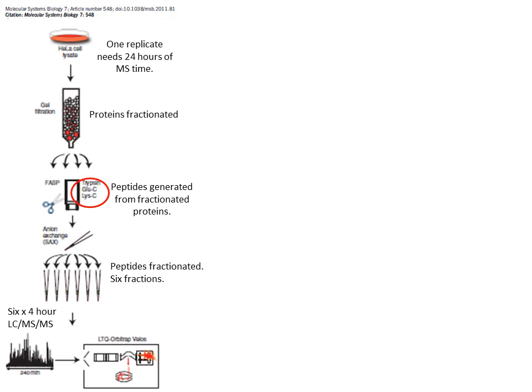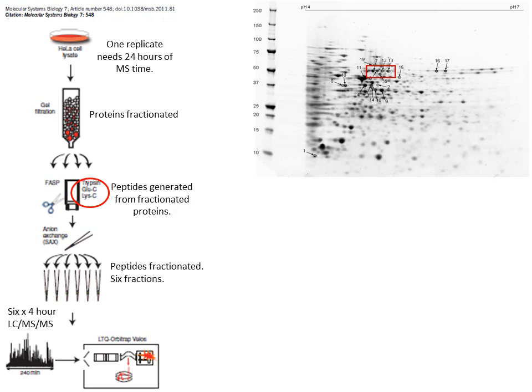This method of proteome fractionation, known as 2D PAGE or simply 2D gels, has many advantages compared to other methods. Chromatography-based methods rely on the need to identify peptides and by inference proteins before differences in protein amount can be determined or quantitated. This means that all fractions of a proteome need to be subjected to LC-MS-MS, requiring considerable instrument time. In contrast, 2D PAGE allows quantitation to be performed before identification.